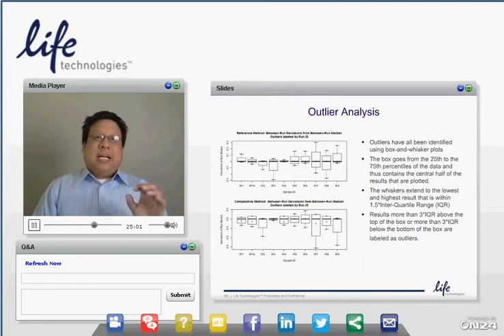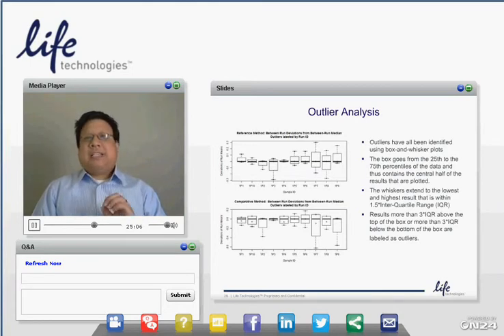Before the statistical analysis is completed, the software immediately does outlier analysis after the last data point is put in. The outlier analysis gives the user a view of what possibly could be an outlier, and it utilizes a box plot method. This here is an example from a method correlation study where they had a reference method as well as a comparative method. This is where they're doing an outlier analysis for each one of the levels that was used in that reference method and that comparative method.